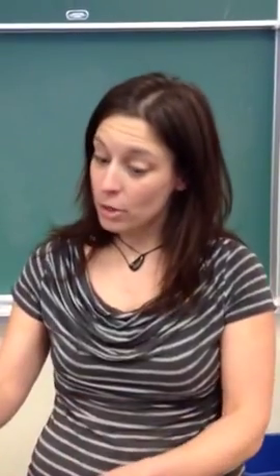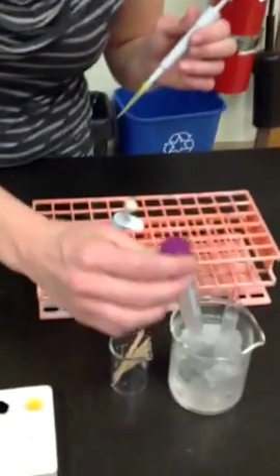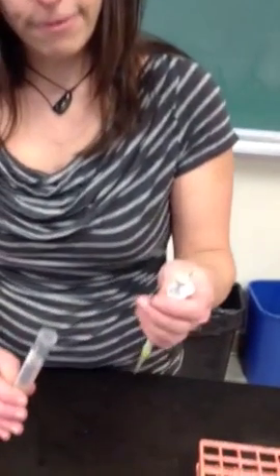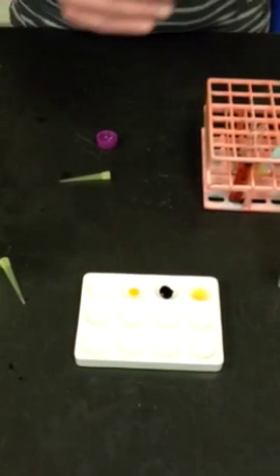So we don't want to contaminate our amylase with any of the reagents in case their presence has an influence on how amylase reacts. So I will change the tips, use a clean tip in my own salivary amylase. I have collected some of my saliva, and I will put it in the well with all of those reagents.